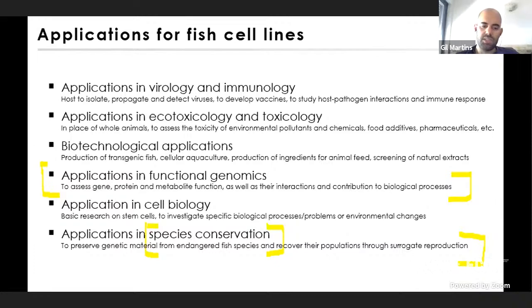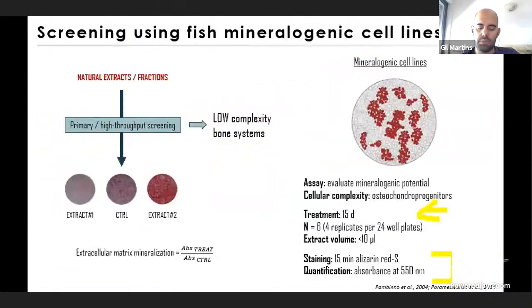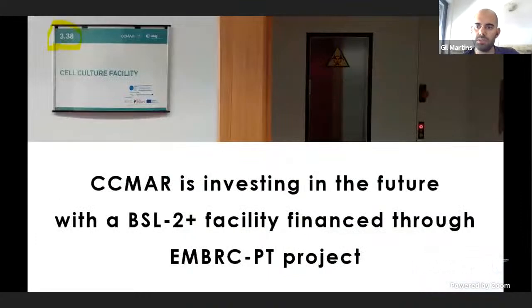And my second question is related to the new cell culture room here at CCMAR. Will there be any possibility to store more cells, for example, in a minus 150 ultra freezer? Well, what are the ideas behind the room?